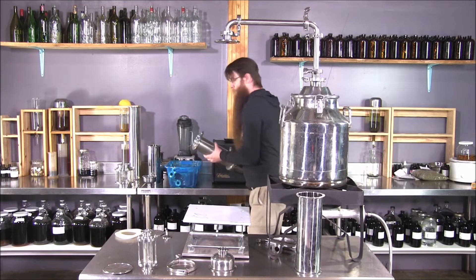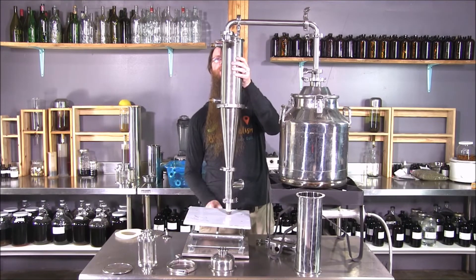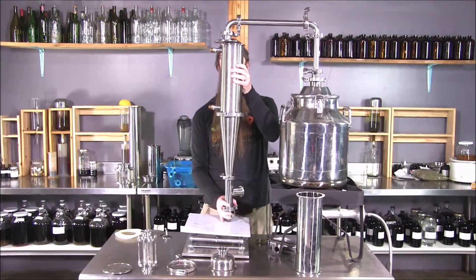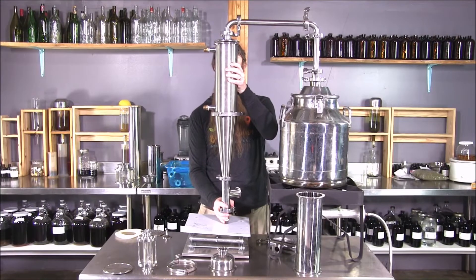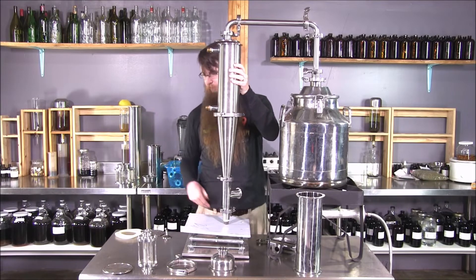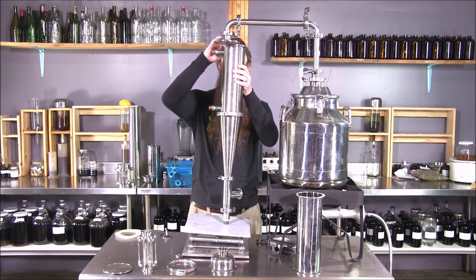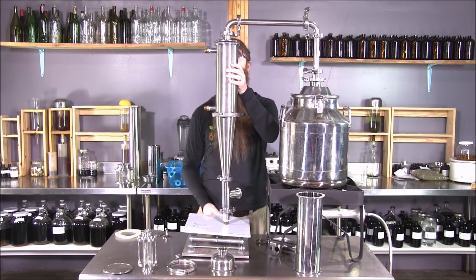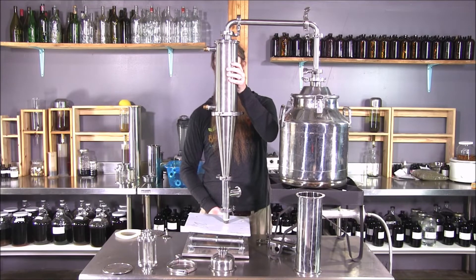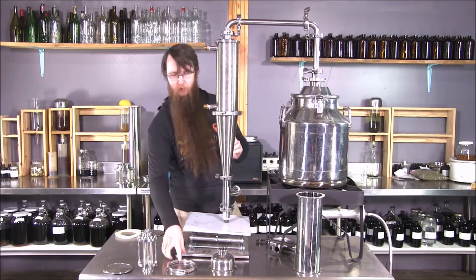So now I went too high. Now I can use the lab stand to get to the right height, attached at the right height on this, which is going to make it a lot easier to set up.